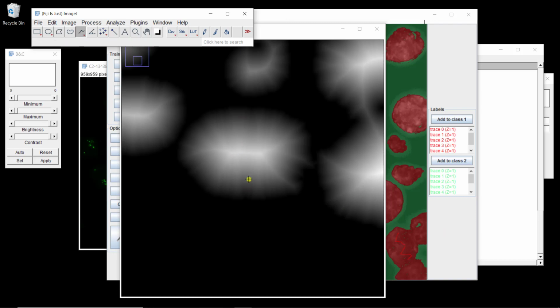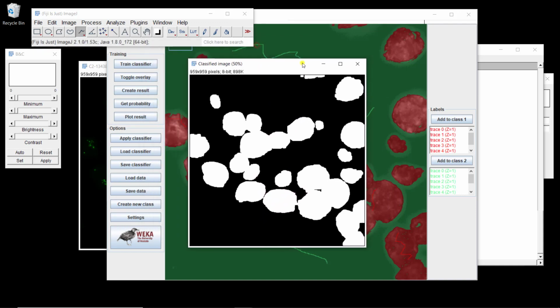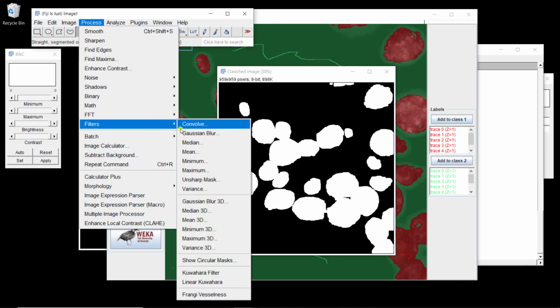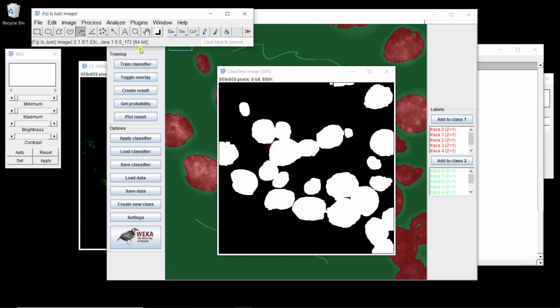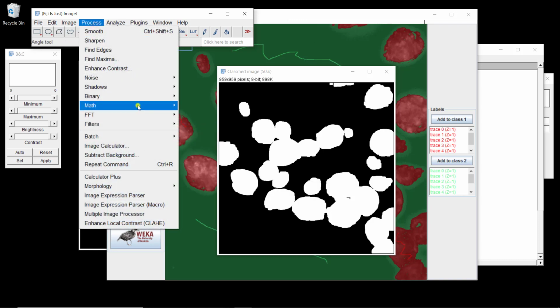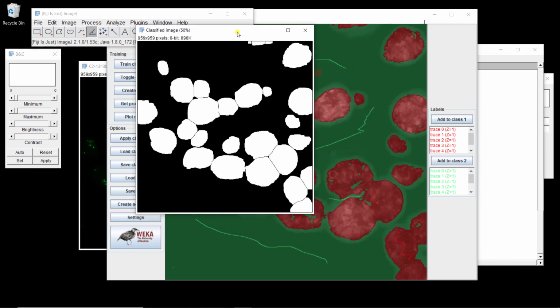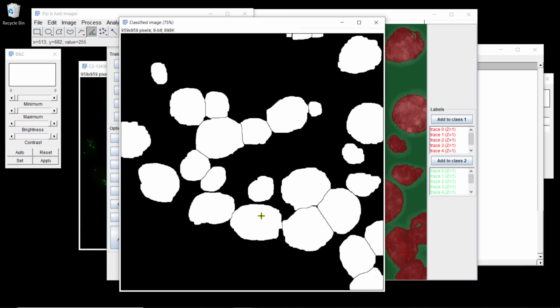I have those two that's separated into two. It's probably also because of the orientation. So the problem is that if we dilate again to try to get rid of this inflection point, it's not gonna help because we're gonna fill in the hole. Maybe you can try if we go to binary, we change to 1, do it, and we do a dilation, and yes, it did the trick. So you see, sometimes it depends on almost nothing. So now we have what we want.